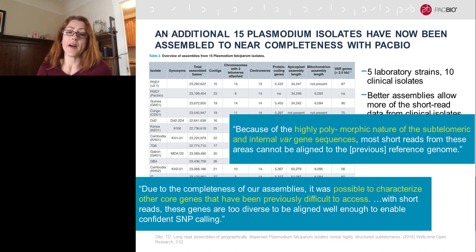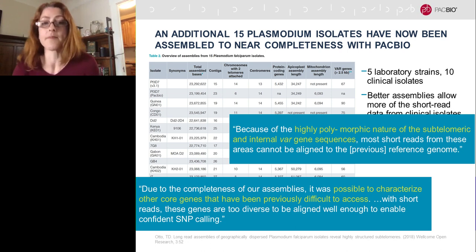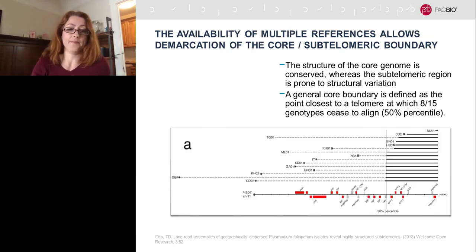But I just wanted to point out that having a better genome assembly, which requires long reads, also enables you to do better SNP calling, right? Simply because you can now map those short reads onto the single correct place in the genome that they're derived from. And in that way, you can tell the difference between genes and pseudogenes, between genes and new duplications. And you can really understand much better things like drug resistance that may in fact be SNP driven.